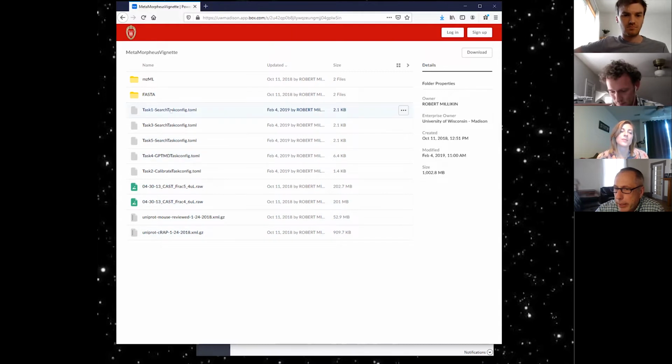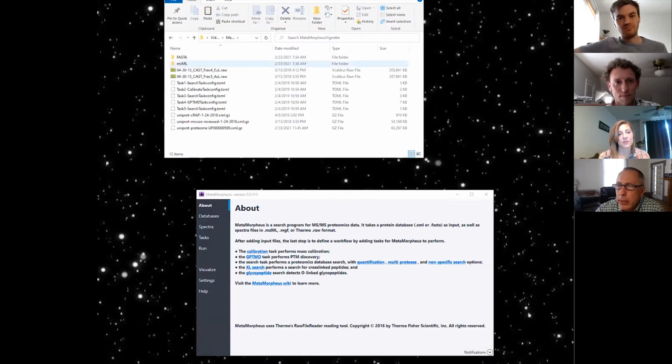Rachel, in just a minute, is going to explain how to use tasks and so forth. But I just wanted to show all of this stuff is here, and I already have it downloaded on my machine. And so that's what I'm going to use to start this video out. I just wanted to explain how we got the data that we're using for this test. So this is the MetaMorpheus vignette file. You'll recognize that those are the same files that we had before.